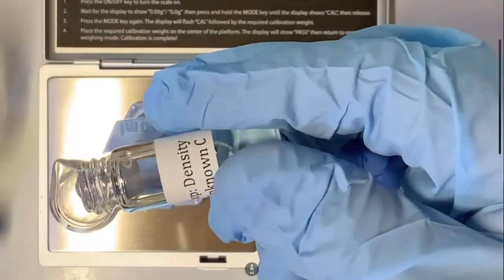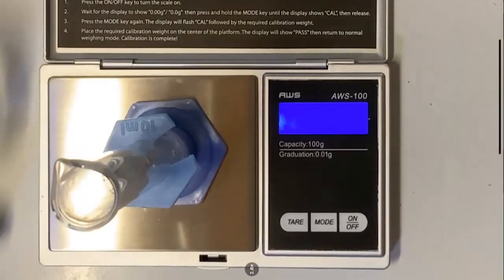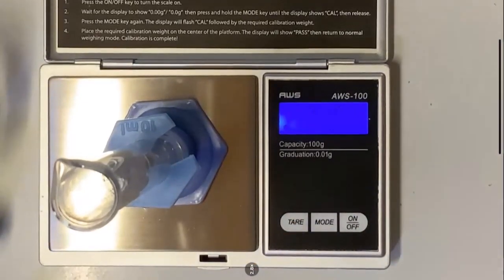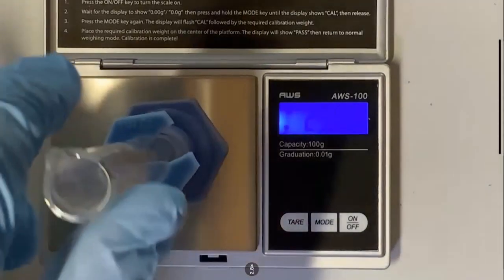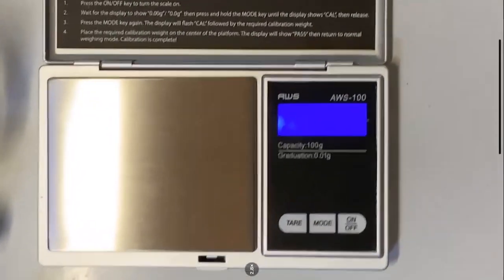And again, I'm going to use even less in this one, okay, than the other. And what I'm going to do is read the mass for liquid C. Read the volume for liquid C.